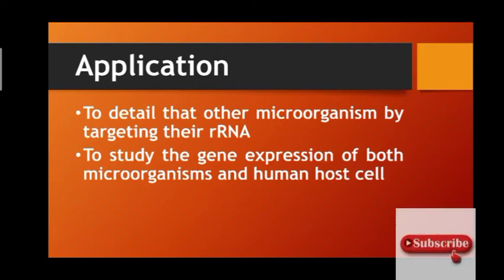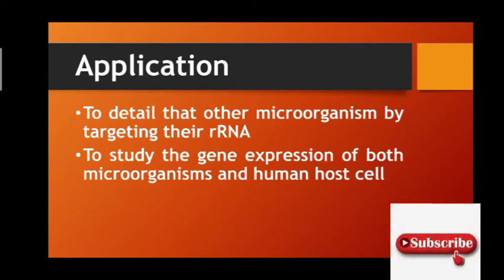RT-PCR may also be used to detect other microorganisms like bacteria, parasites and fungi by targeting their rRNA. Detecting mRNA using RT-PCR helps to study the gene expression of both microorganisms and human host cells.